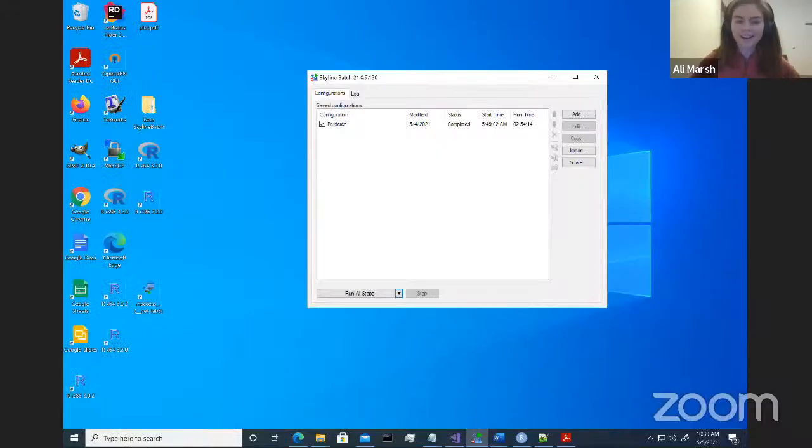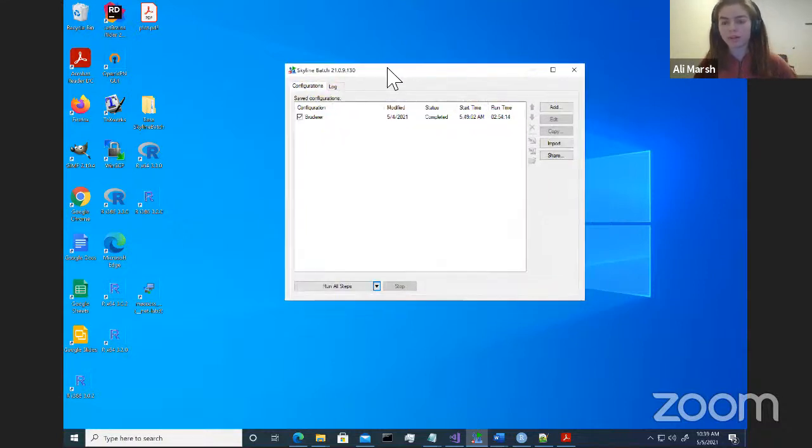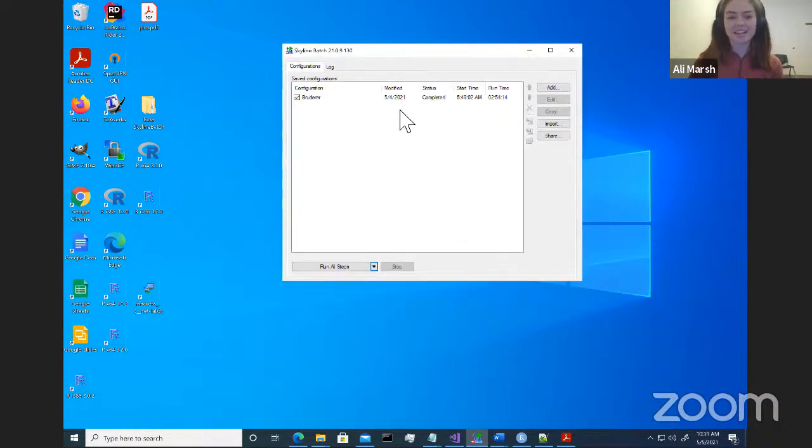All right, hello again, everyone. I'm going to quickly go through exporting and importing configurations. Like Brendan was saying, the configurations that we're going to be importing today are a little bit more complicated, and there's also 5 of them. So given the time it took to make the one yesterday, we're just going to be importing them, so we don't have to go through that whole process again.